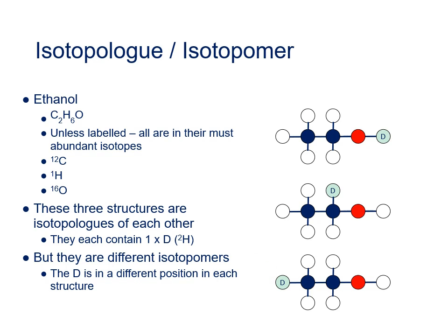Now, if we were moving a functional group around different locations in a molecule, we'd call the different resulting molecules isomers of each other. In this case, we're moving around the positions of different isotopes within a molecule, so these are isotopic isomers, and we abbreviate that to isotopomer.